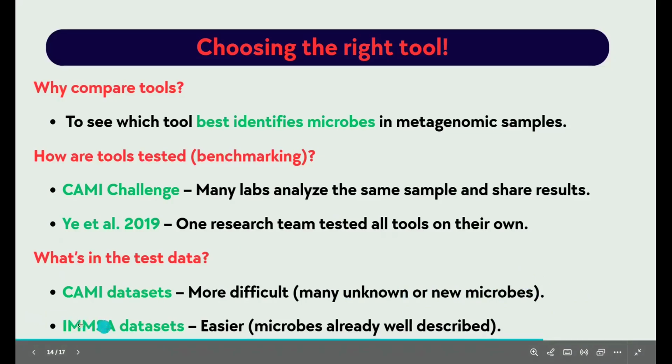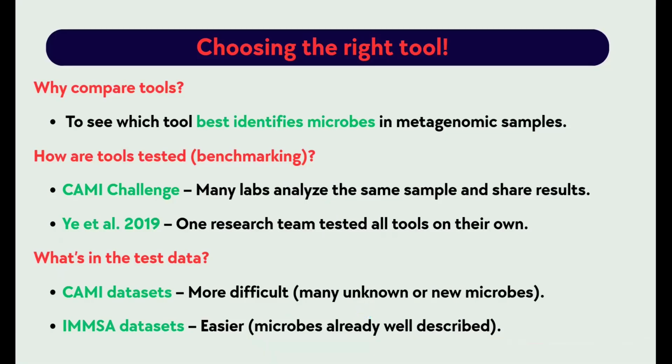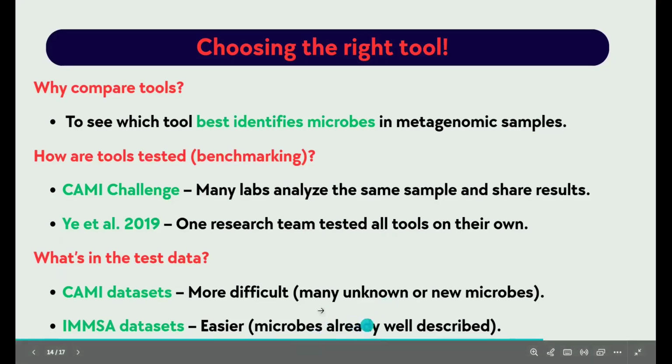The second dataset is IMMSA, which Ye and his research team used. It's easier as microbes already are well described. All microbes in these datasets are already known. So tools usually perform better here.